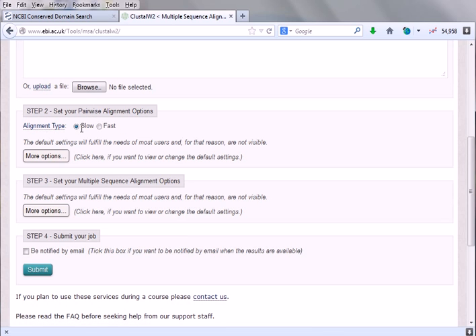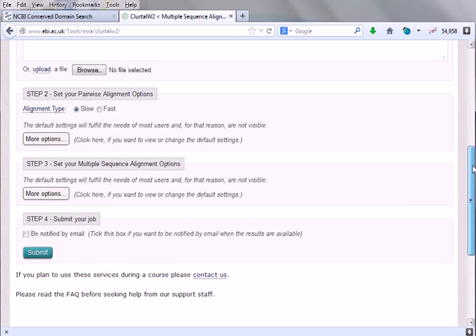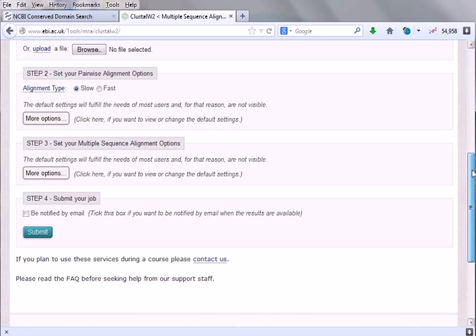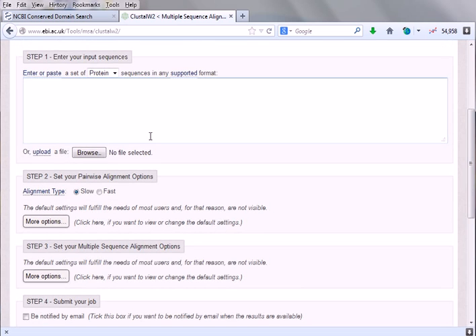The alignment type can be slow or fast. Here it says the default settings will fulfill the need of most users. In most cases, this default setting is quite sufficient. If you need to do very special things, then only you need to change the parameters. We won't change the parameter here. We simply go with the default one. Third is set your multiple sequence alignment options. Many options are there, but default settings are provided. Simply we'll be uploading our sequence.